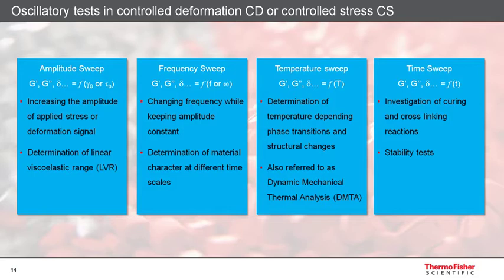In a time sweep, all rheological conditions are kept constant and only the structural changes of a sample over time are monitored. Time sweeps are used to measure the relaxation or stability of a sample, as well as for the investigation of curing and cross-linking reactions.